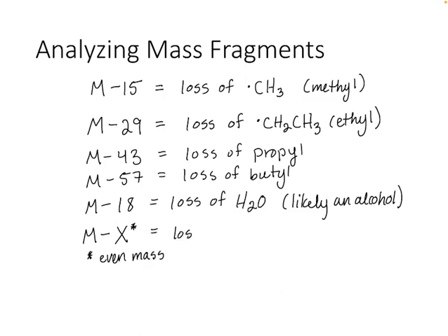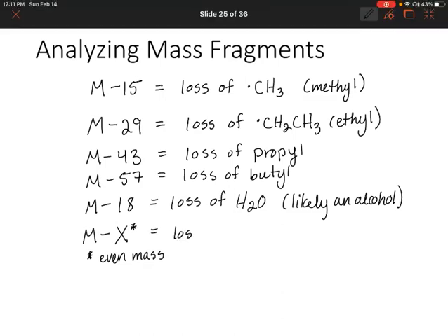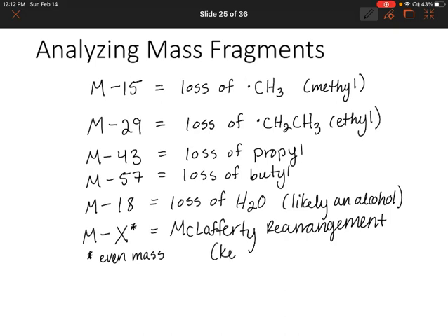And that indicates something called McLafferty rearrangement. And this is a pretty common occurrence if you have a ketone or an aldehyde. And we'll talk about that in more detail in a bit.